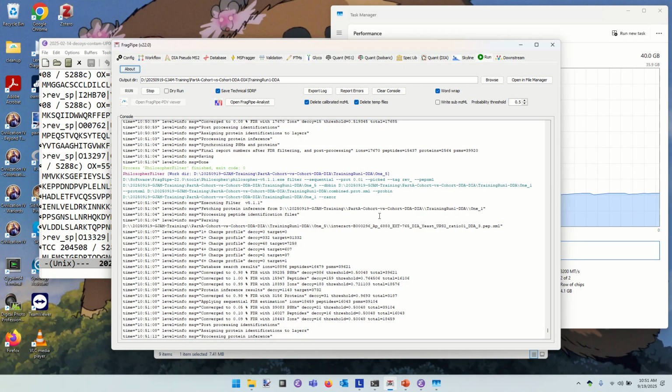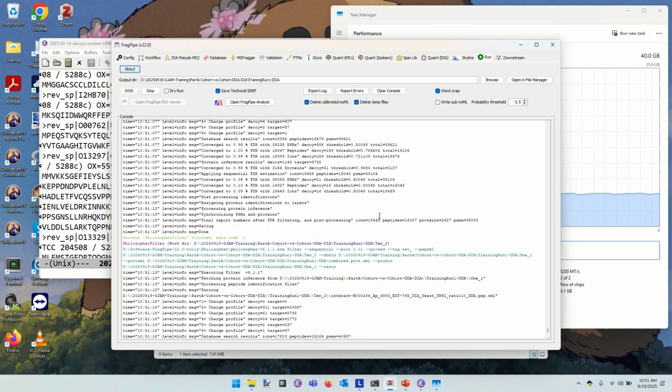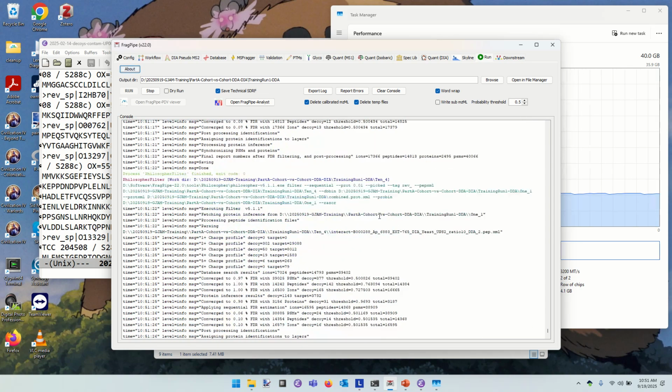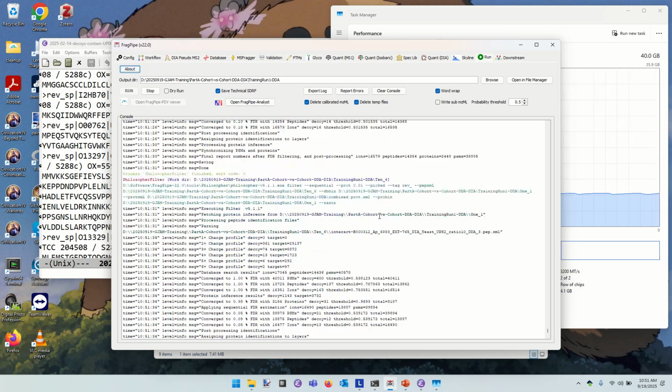And we're trying to do comparison across experiments as well, which means we need one protein list in common that spans all 6 of the experiments. So those are the kinds of things that are happening at this stage. And now we see that we're into the filtering stage, to actually apply the rules that the software has inferred for separating the good from the bad PSMs.